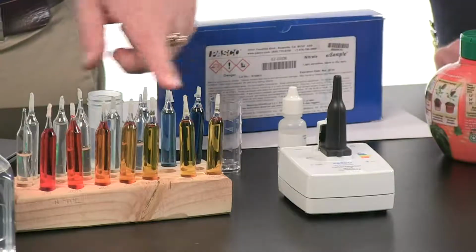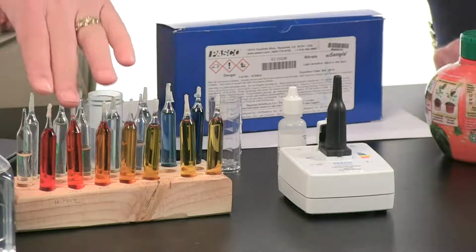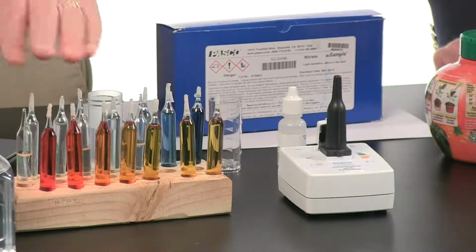You can see, just as an example, here's a nitrate set of solutions that get stronger and stronger, and as you get to the end, you can see it gets darker, and that's the concept that we're going to do. But when you get out there, how do you set it up so that you can use something as simple as your own phone and then connect to the colorimeter? So all you'll need are these two things and some snap kits, which will come in a container like this kind of size. And the directions are all in there. But let's take a look and see what we have to do to set those up.